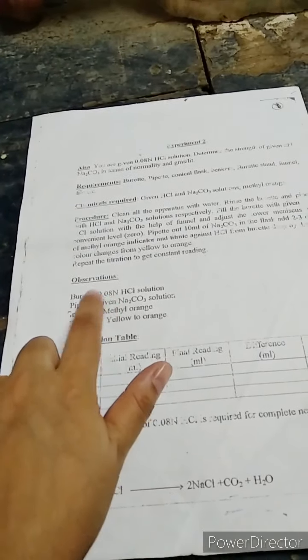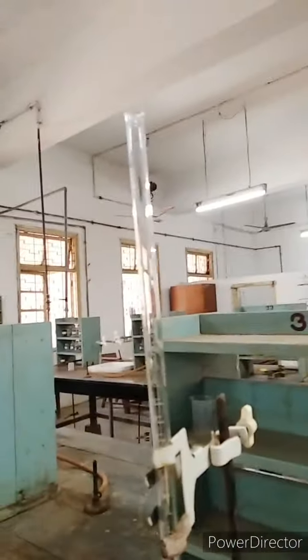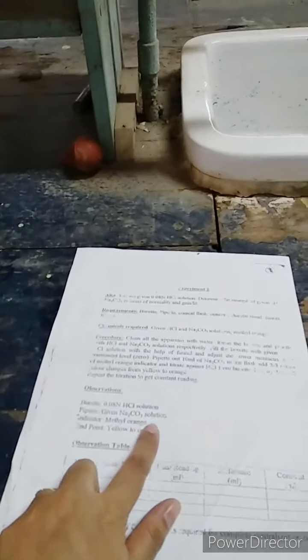In today's experiment, what we have in the burette is HCl of this concentration. So, we will take a little amount of HCl solution and rinse the burette with that HCl solution, and rinse the pipette with Na2CO3 solution. Let's start with the experiment.